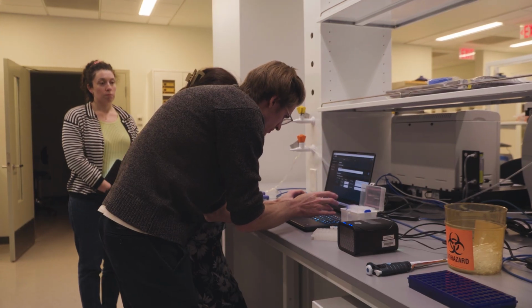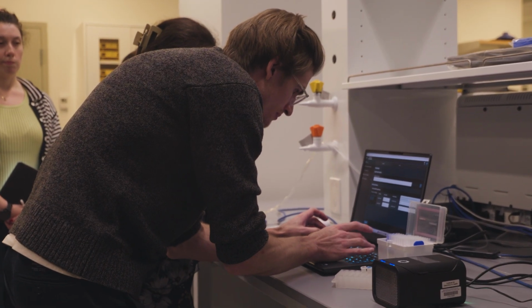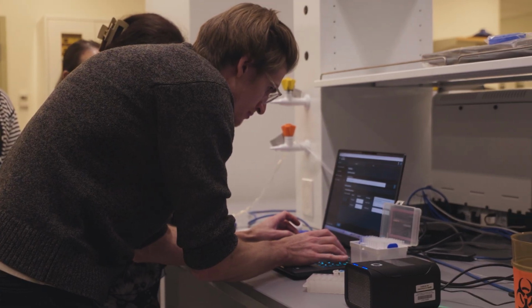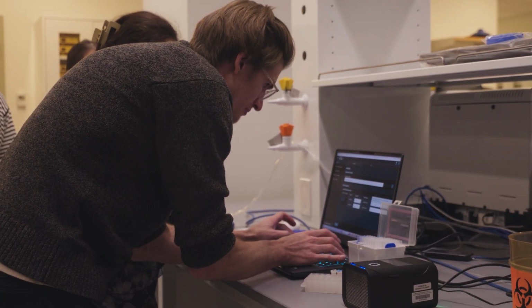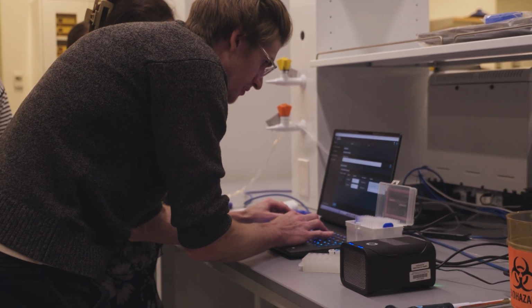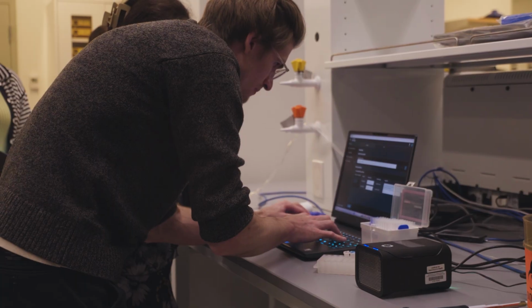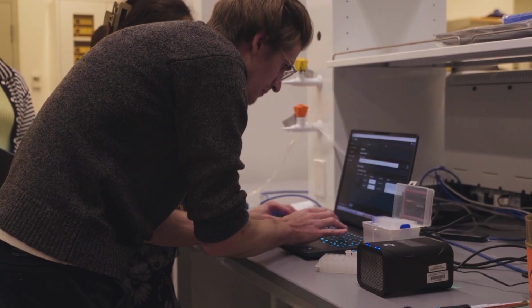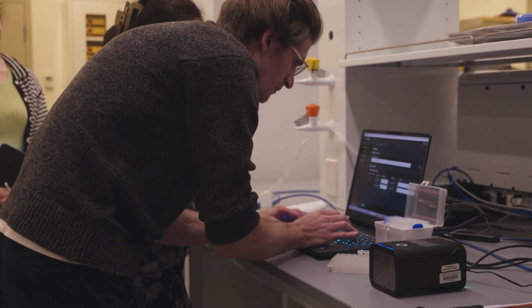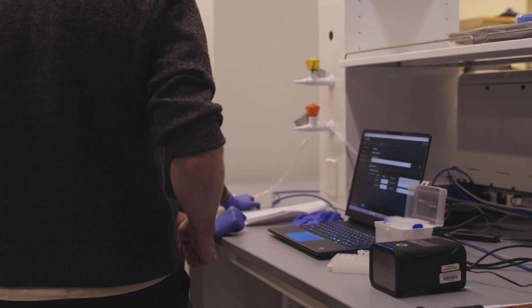So I want CSF. Any other extension you want to add for your sample identification, you can do it. No, unless you think I should add more. Do you want to add, just for our own record, the barcode? Yes, please. So I think the CSF ones were 1 to 3, right?